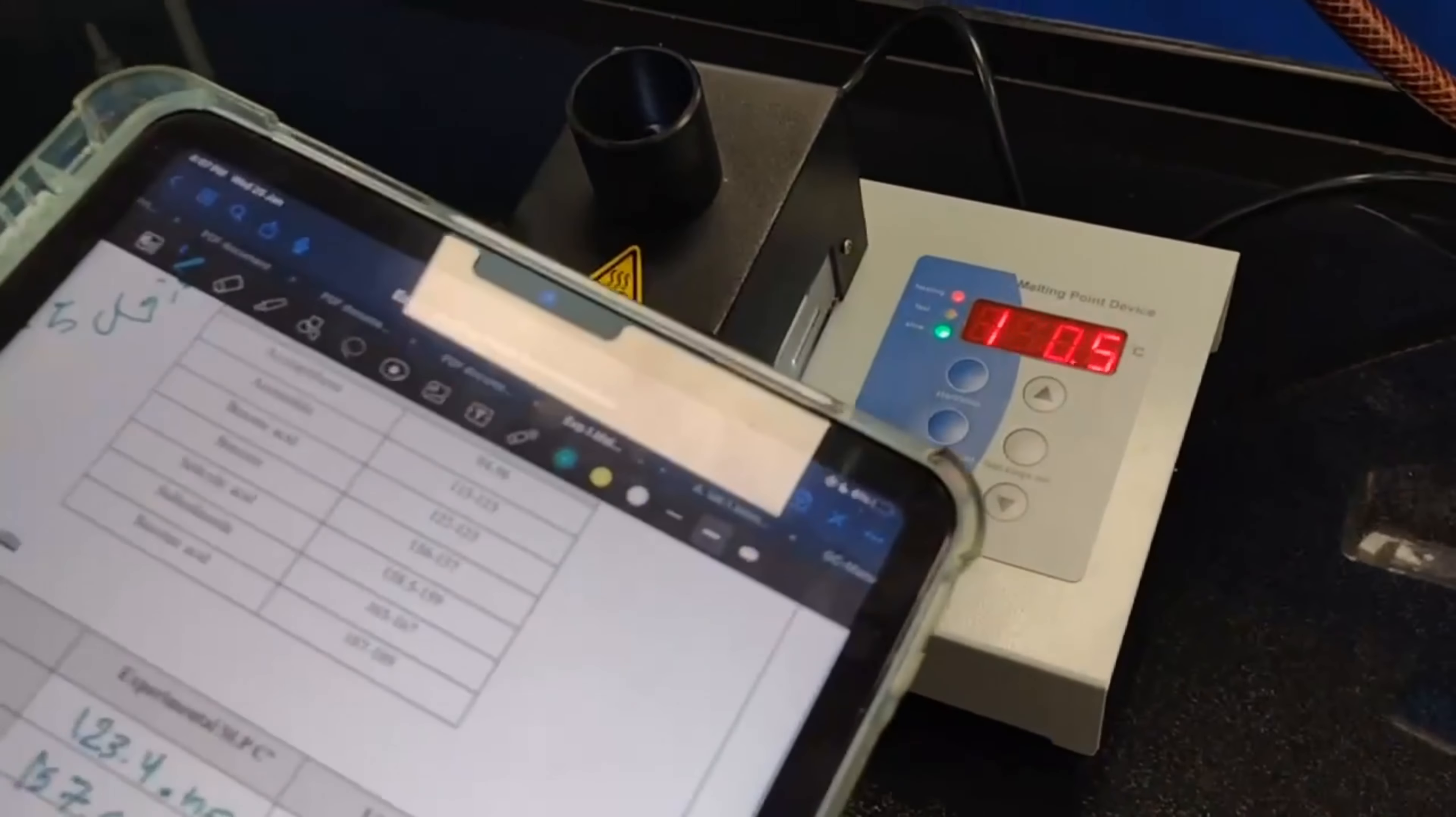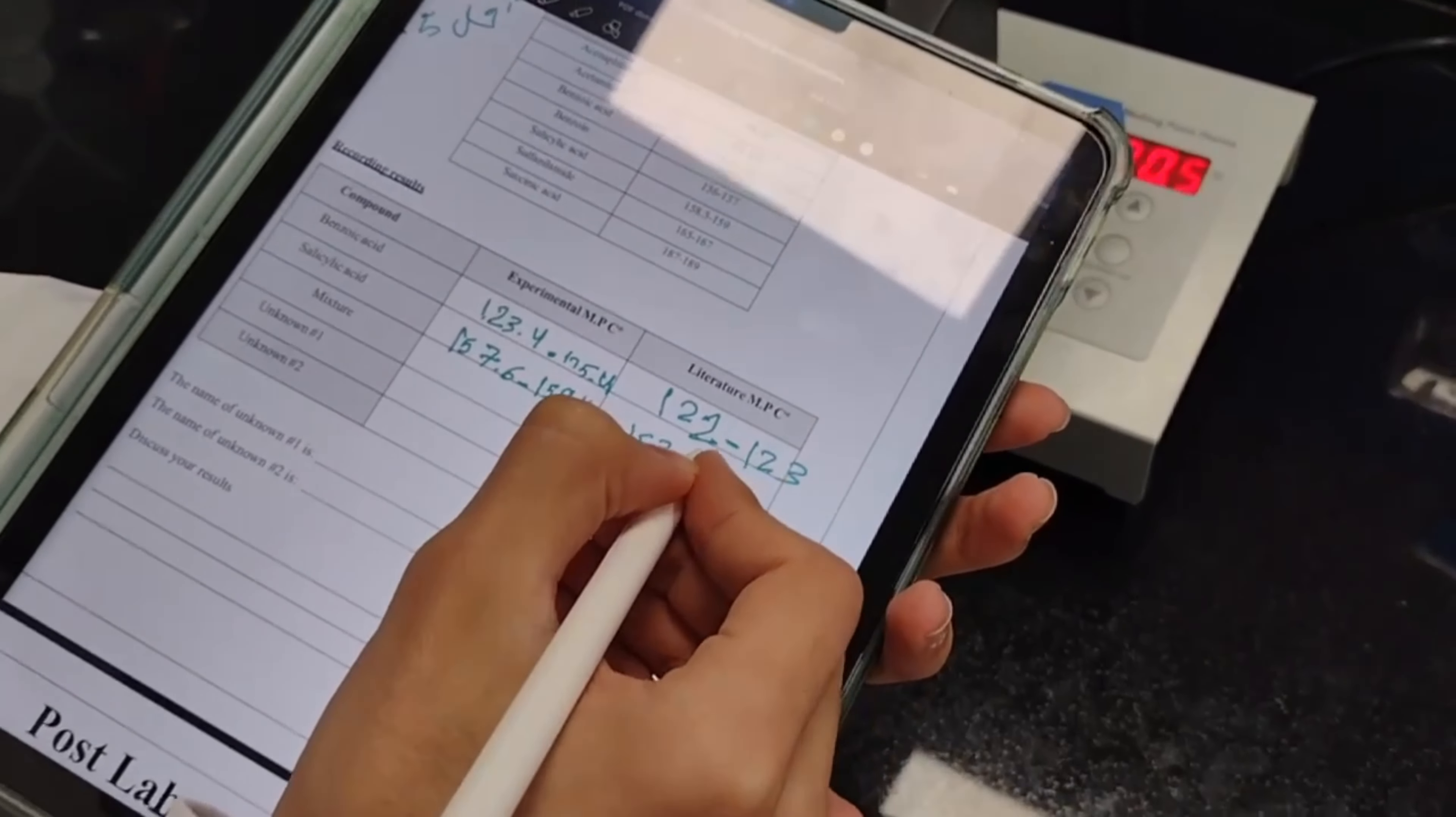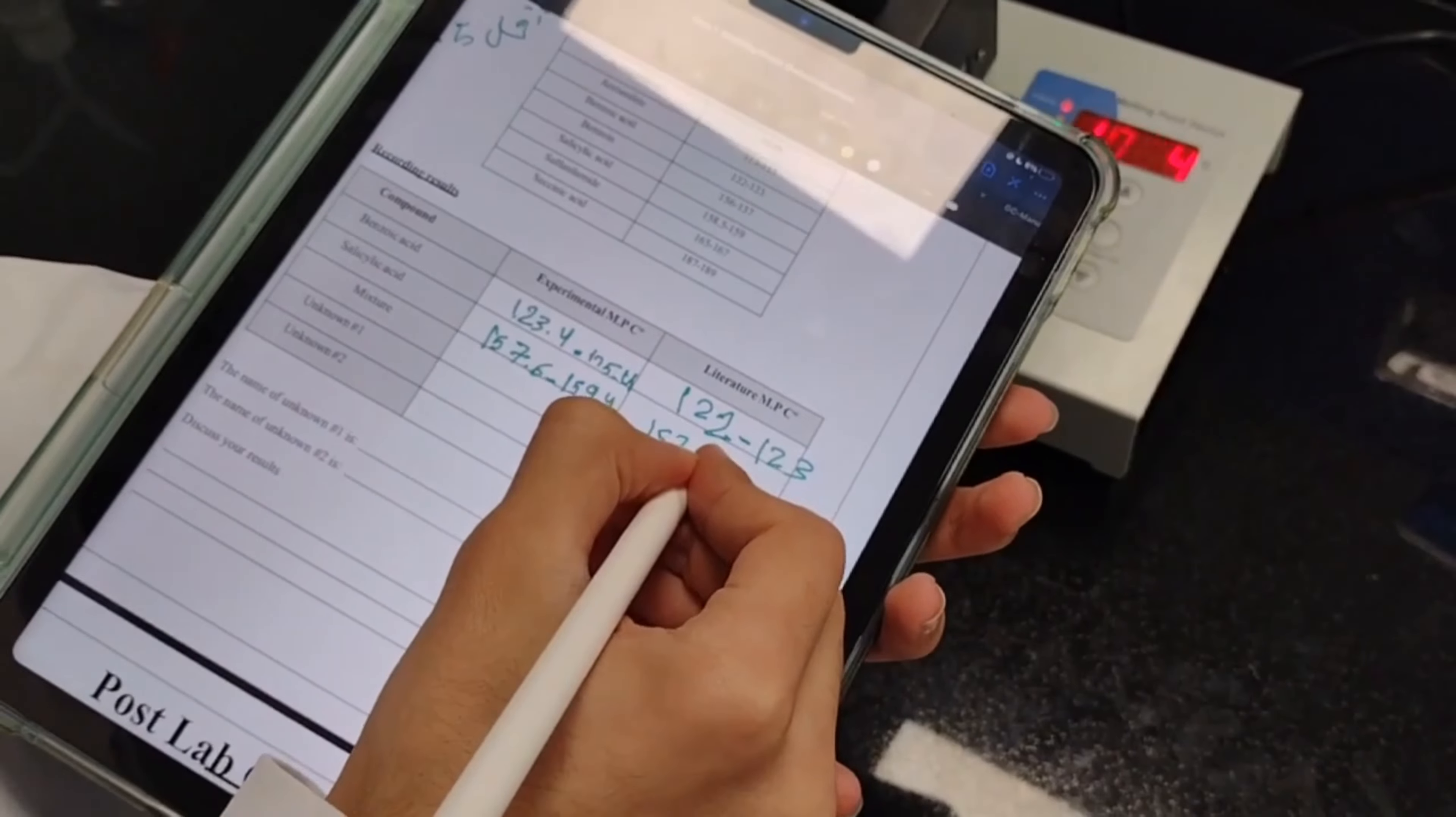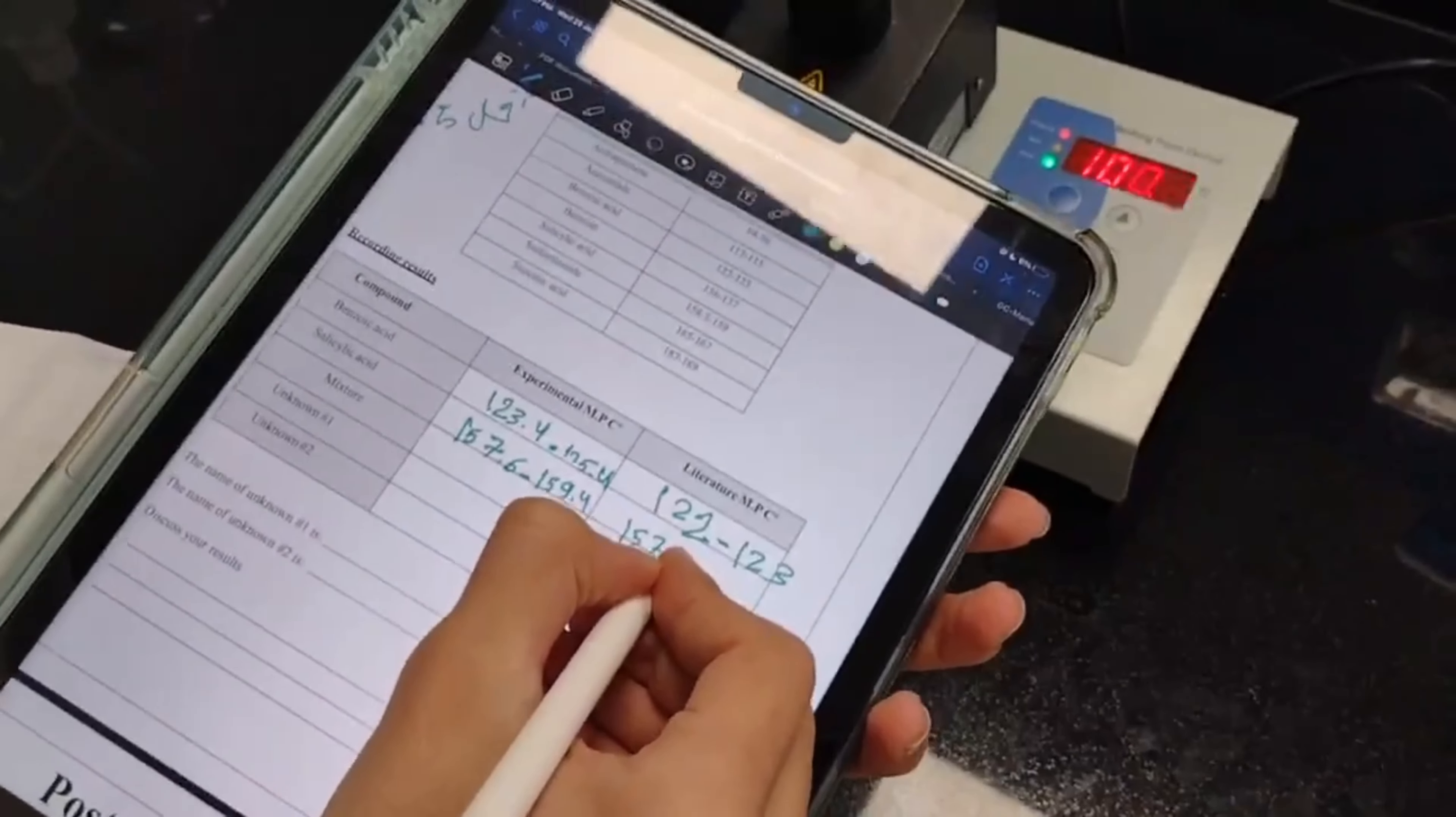And the temperature was set to fast speed until 115 for both of the unknowns. And here is the first unknown melting.